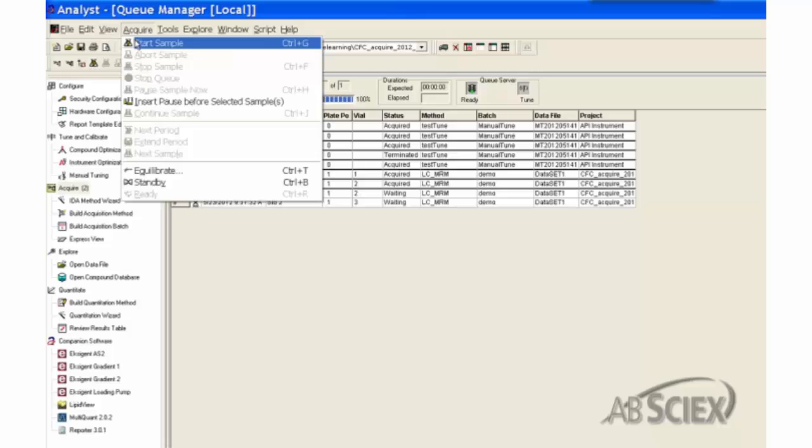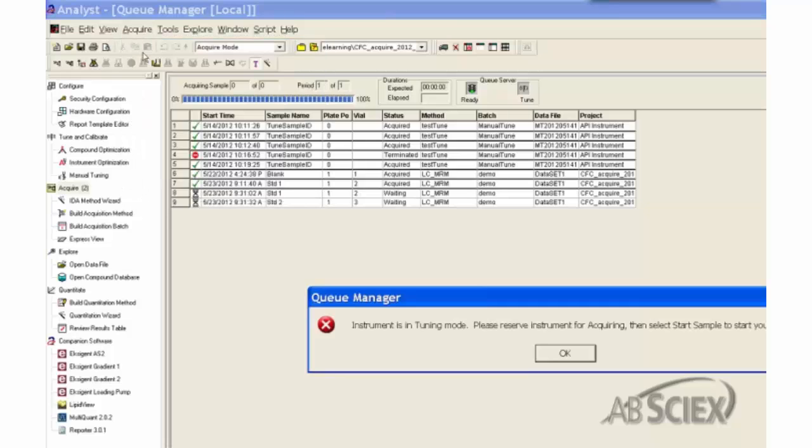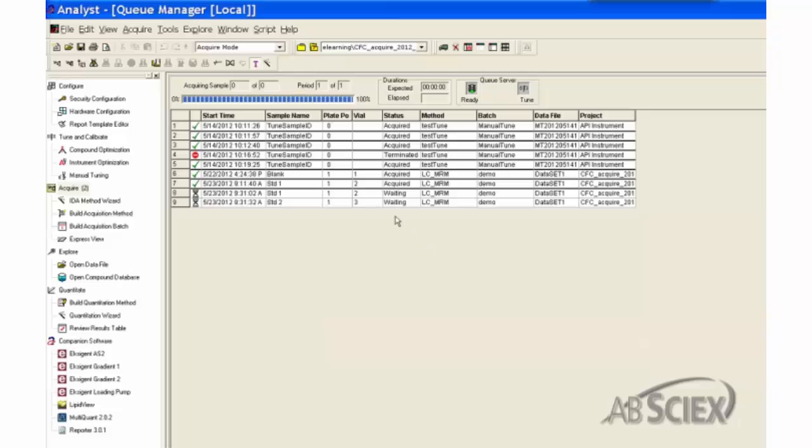If you get an instrument is in the tuning mode error when attempting to start the queue, unclick the T button to remove the instrument from the tuning mode and then click on the Start Sample button again.